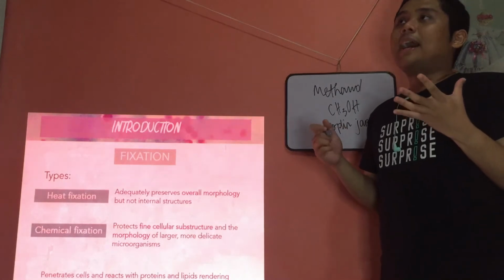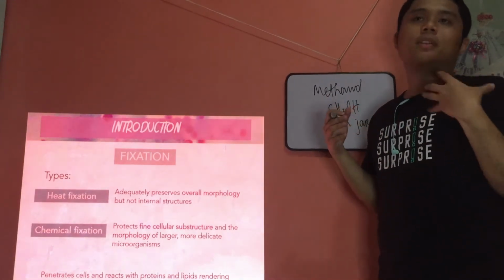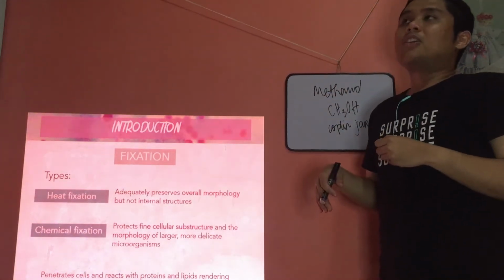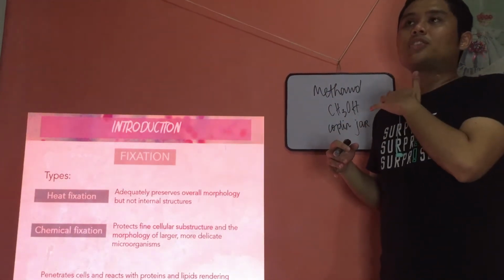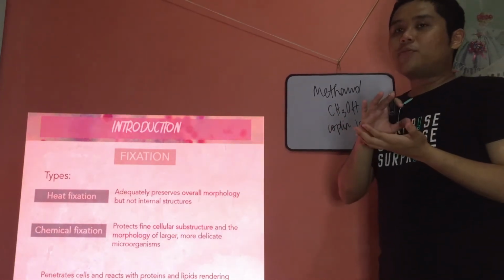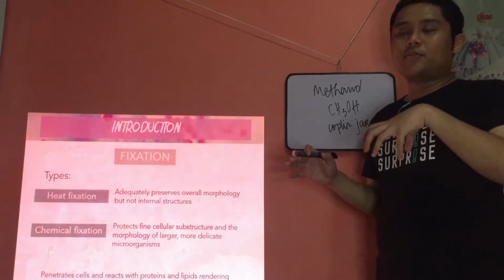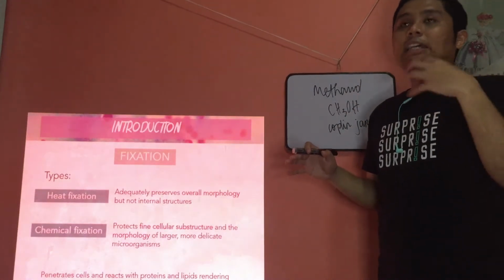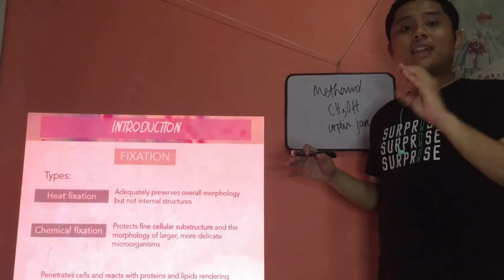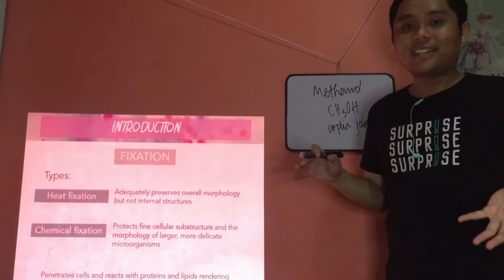Imagine you take bacteria from a body site in vitro. It's outside of its normal habitat. If the essential nutrients of the bacteria are not met, like if it cannot be transferred to a culture media, the next thing that could happen is that they will die.